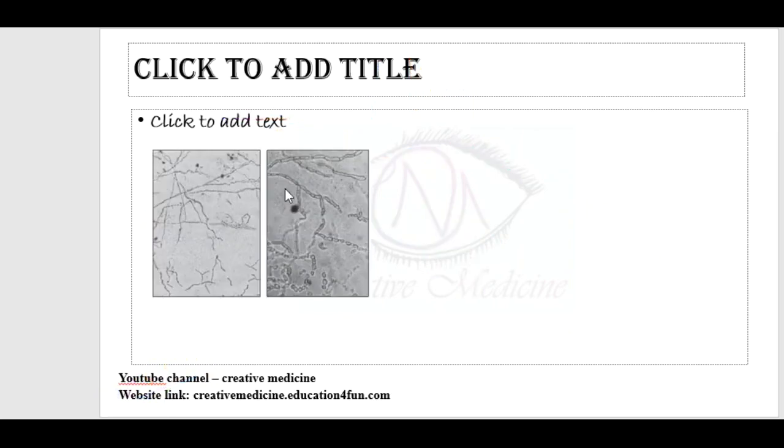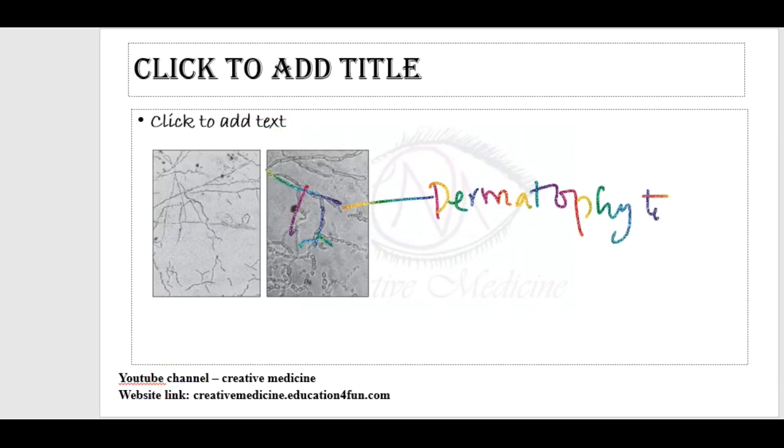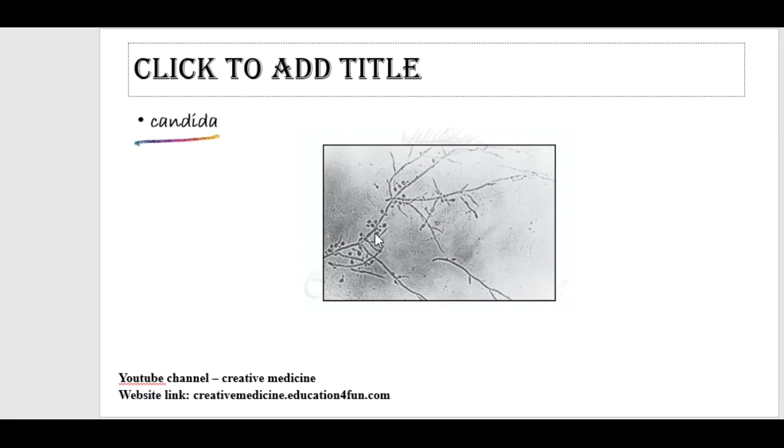Dermatophytes on KOH smear are seen as branched septate hyphae. Candidal infection on potassium hydroxide smear is seen as budding yeast cells with pseudohyphae.